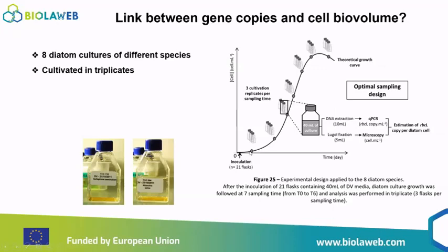You can see here that the culture is growing. There is an exponential phase, and then it should have a plateau and then decrease.